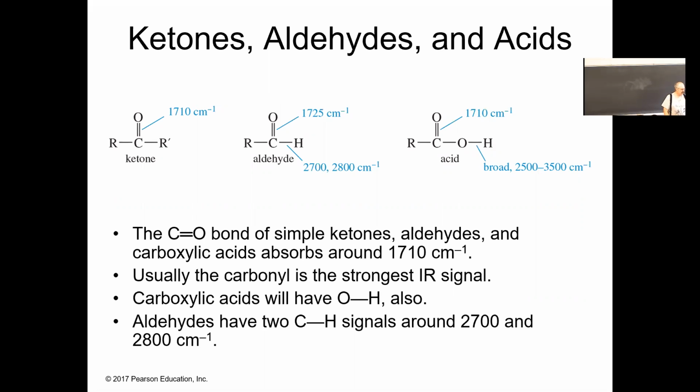The carbonyl stretch, because of its dipole moment and the fact that stretching it causes a change in the dipole moment, is almost always very distinct and very intense. The carbonyl occurs in a number of different functional groups, including ketones, aldehydes, and carboxylic acids. And notice the CO stretch is about the same frequency. But we can distinguish among ketones, aldehydes, and carboxylic acids by looking for other stretches.